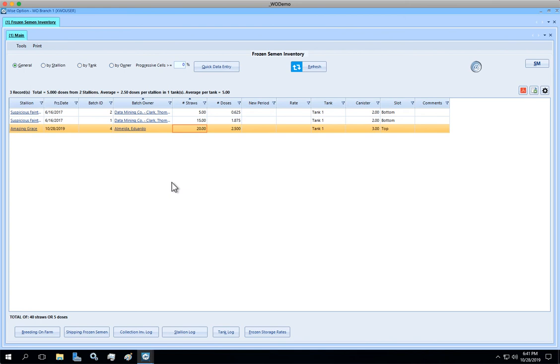So today in this eLearning, you'll learn how to process frozen semen on a regular basis, not quick data entry, on a regular basis, coming from the collection management in the Stallion management for WISE option.